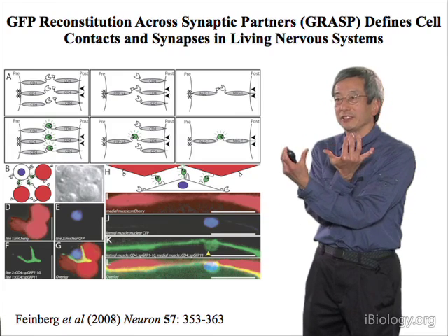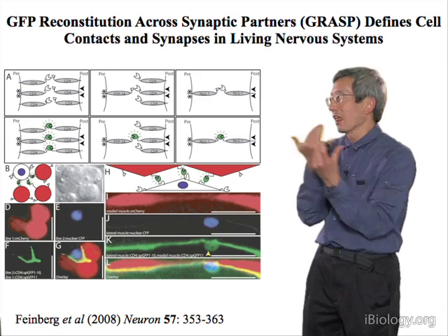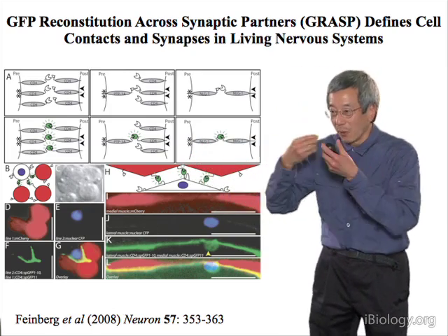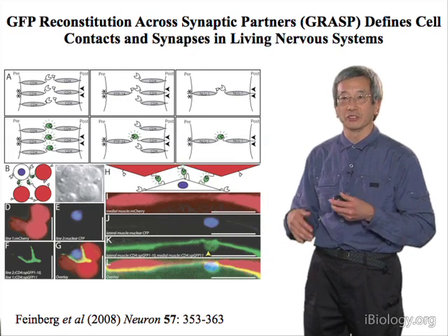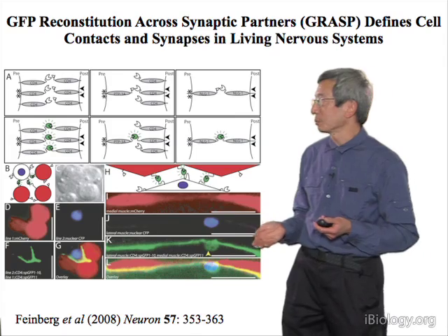In circular permutation, they were held together, but just out of the normal order, sort of back to front. Here, we take some other scaffolding and hold them together. If we do it right, we can generate fluorescence where there was none before, and there wouldn't be any if we didn't bring those two fragments into proximity.